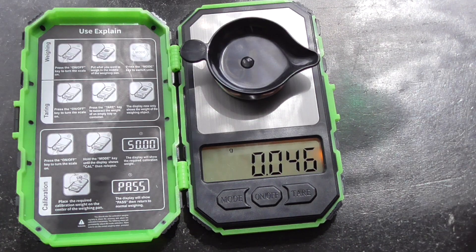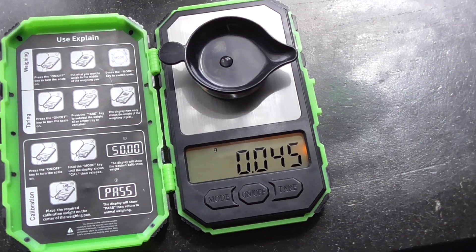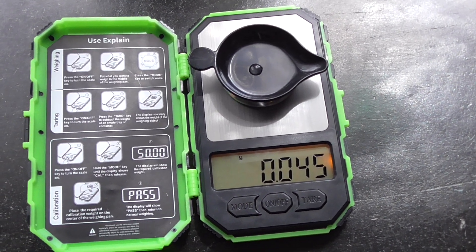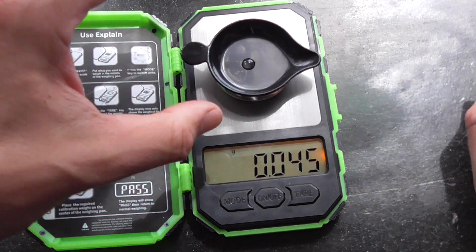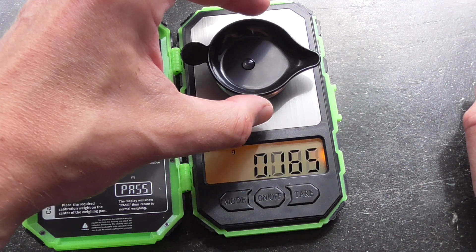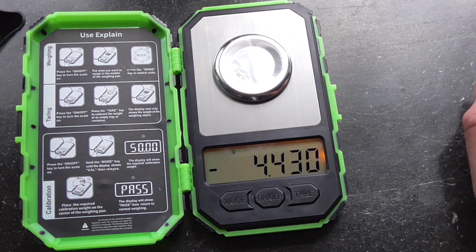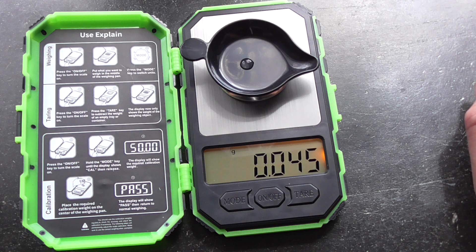Let's put it back and see how much it still is — 45 milligrams. There must have been some evaporation, and I played around with the scale with my fingers, so of course there will be some little fluctuation.